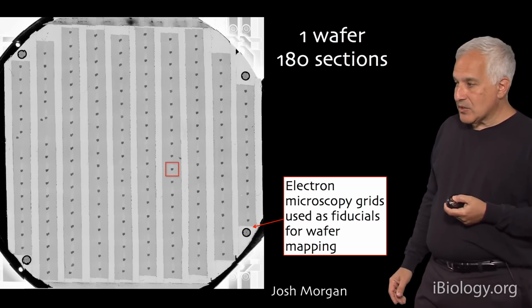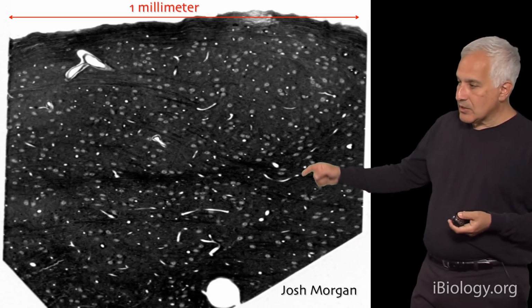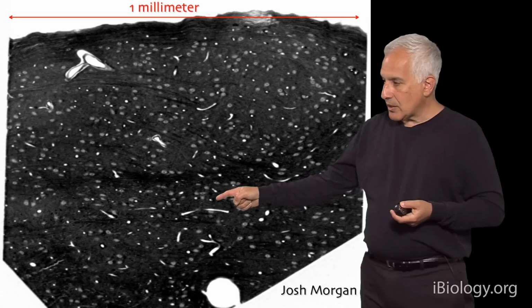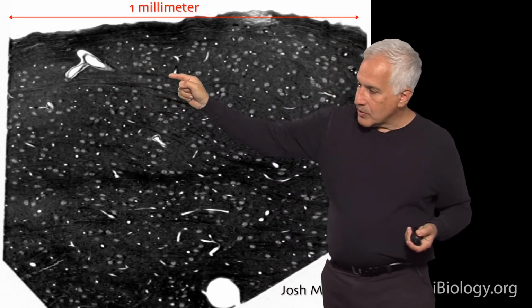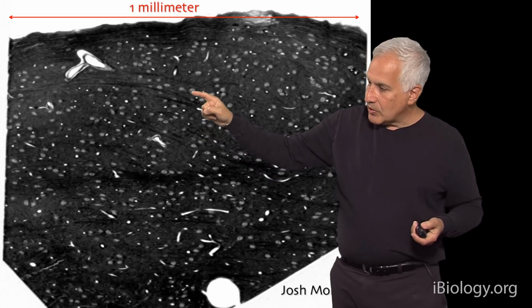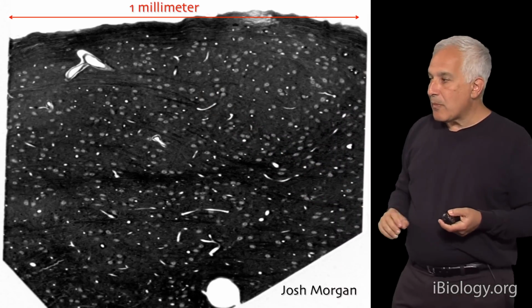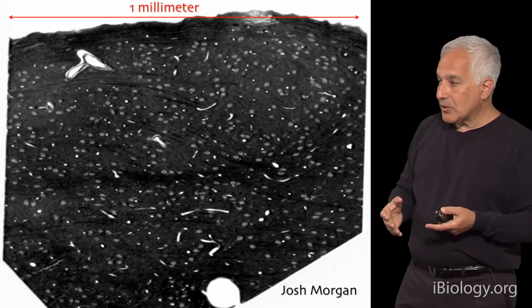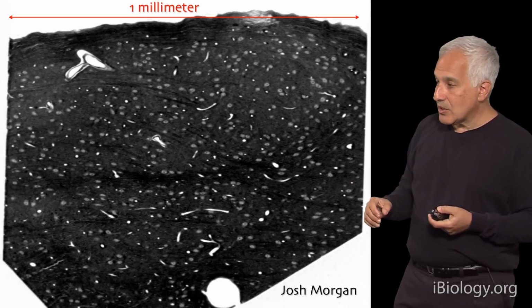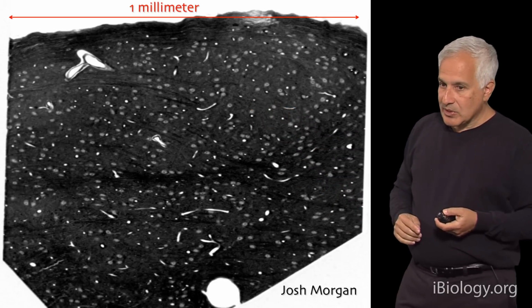And if we zoom in on one of these sections and look at that in the electron microscope, that's what a section might look like. So what you see is a bunch of blood vessels. These big light objects are blood vessels. There's one up there. And there are some smaller ones here. And then in between these gray circles, those are neurons. And these dark streaks are clusters of myelinated axons that are ensheathed in a lot of myelin. This is stained with the heavy metal osmium that coats all the membranes dark, and myelin has a lot of membrane in it, so you see a lot of darkness. And then again, between the cells, all you have is felt work. And I'll show you what's in there in a moment.